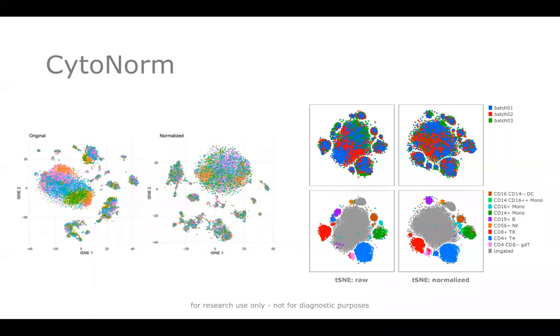That can then be used as a control downstream with CytoNorm to try and remove some of those batch effects. So the idea is that you would have a set of parameters that you run with a normal analysis, and then the next time you bring in some new samples, you could normalize those samples to your initial batch of samples and continue your analysis from there.